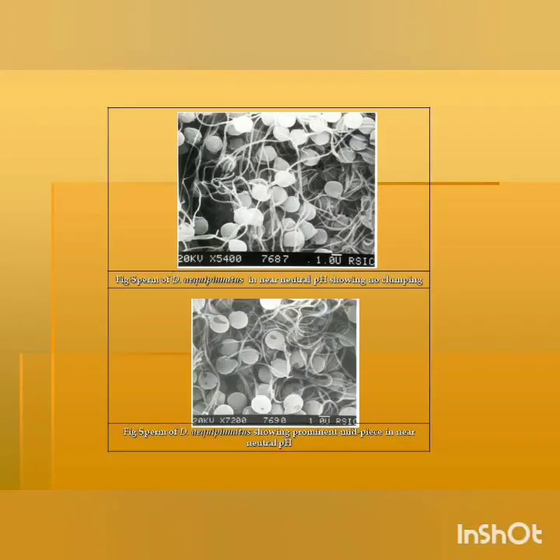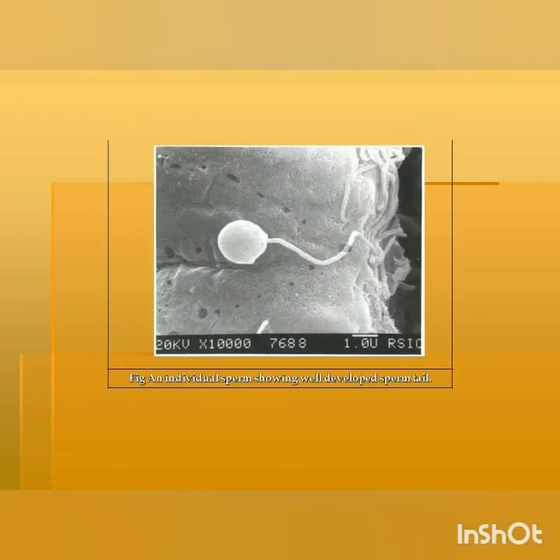Section of D. equipinnatus showing the prominent length of the sperm in neutral pH, which indicates that acidic pH really disturbs even the reproductive structure of the fish. This is the micrograph of a sperm of the fish grown in near-neutral pH. That means the sperm head and the sperm tail are not at all disturbed.